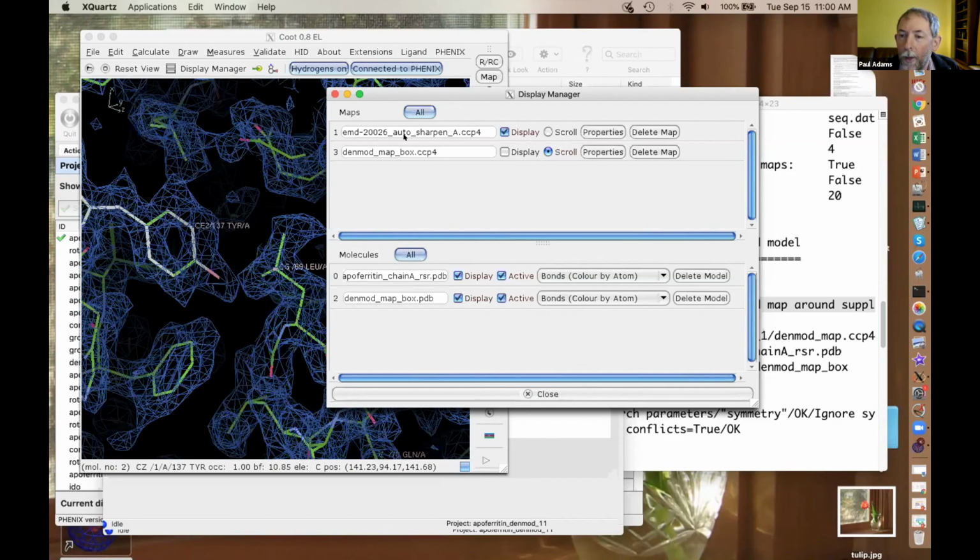This is great. It's based on the assumption that we already have a map. Yes. What if we're dealing with an unknown structure and a homologous model? Well, this is based on having maps. We have to have maps to do this. We can't deal with that situation.